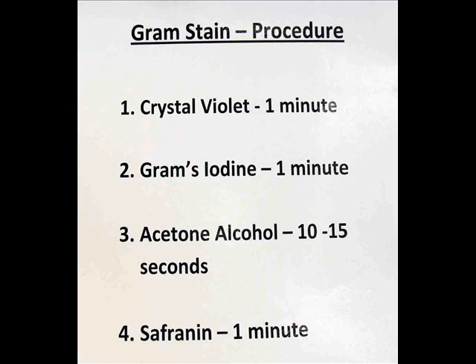The second step is to apply Gram's Iodine. This is a mordant that will bind with the Crystal Violet. I leave that on for one minute and then I rinse.